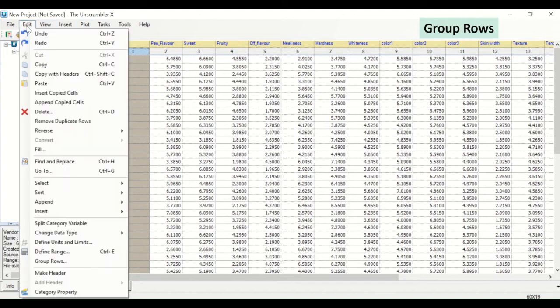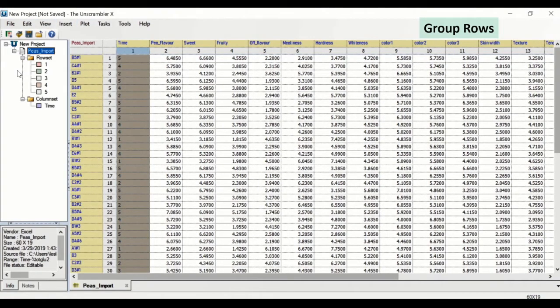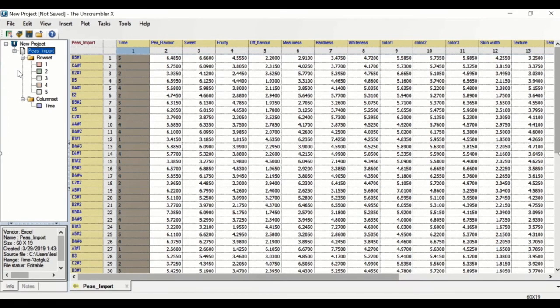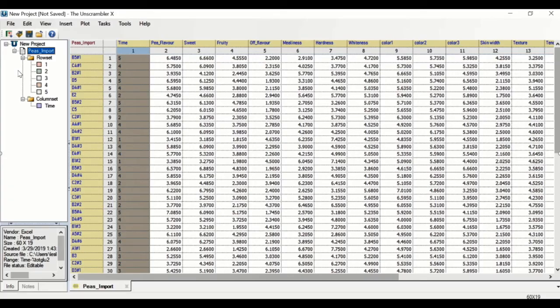From the edit menu, use the group rows function to create row sets from category variables. After importing and organizing your data, you are ready to start converting it into useful information.